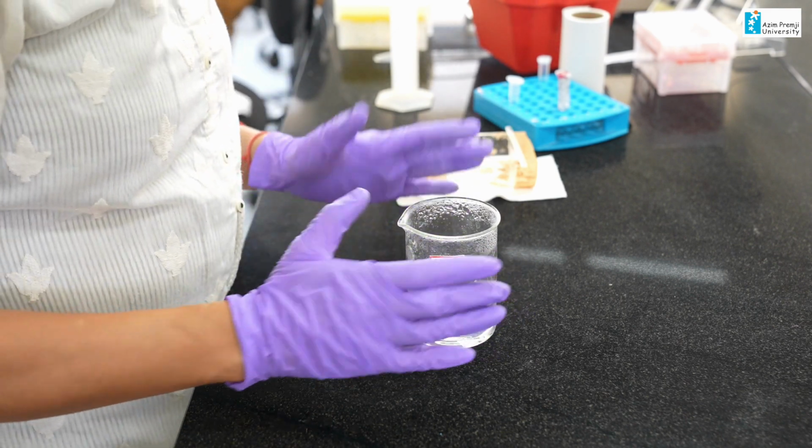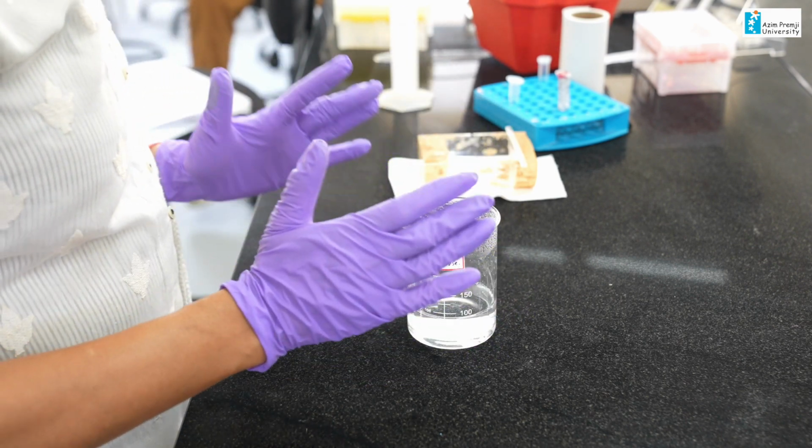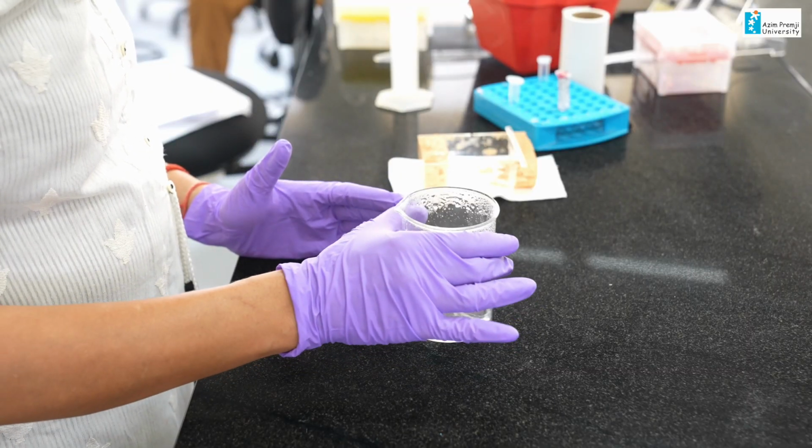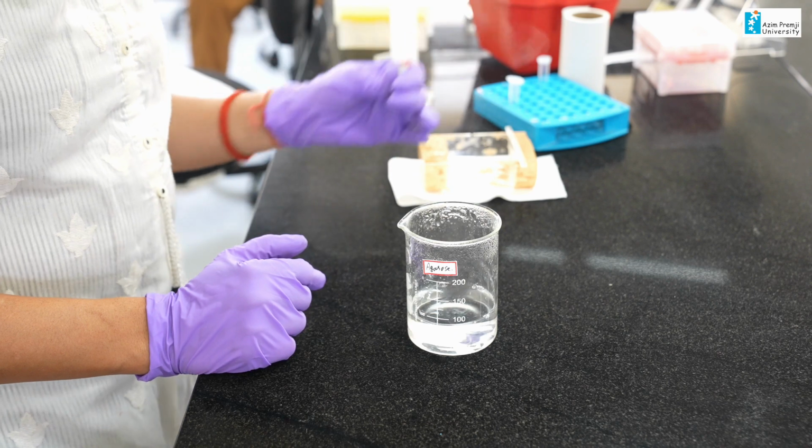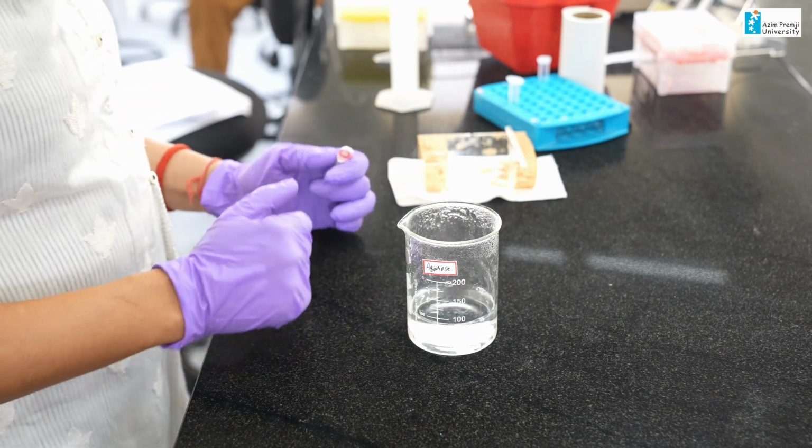Now, I am going to allow it to cool till it becomes around 40 degrees and then add ethidium bromide into it. Ethidium bromide is a carcinogen, you should handle it with care. You should not touch it. Always wear gloves when you are using ethidium bromide and discard the tips, the microtips we have used, in the containers carefully.